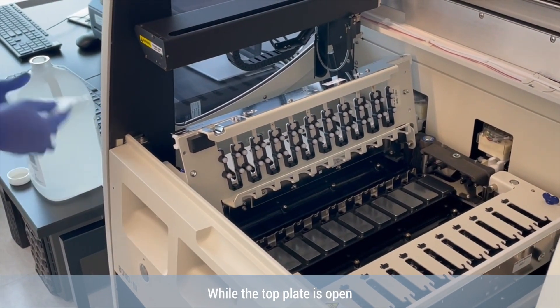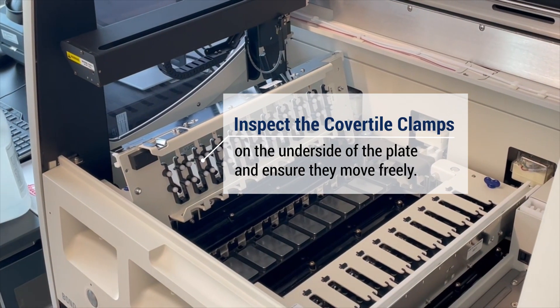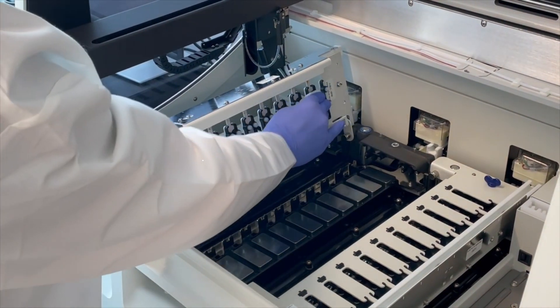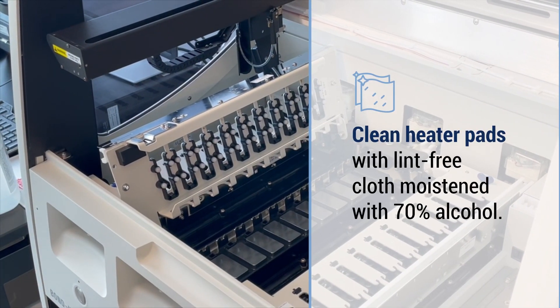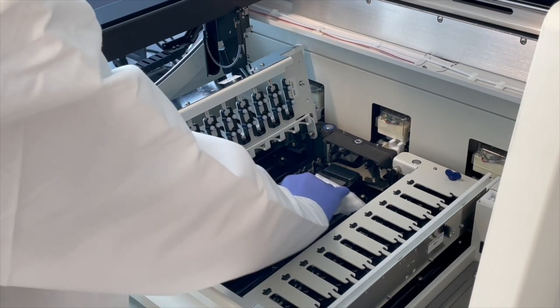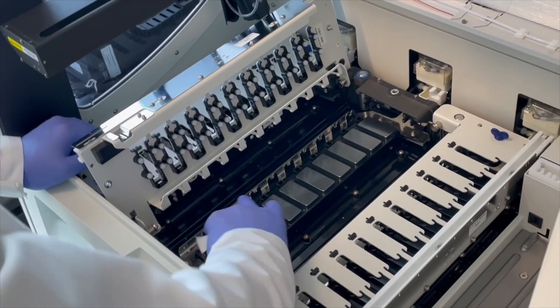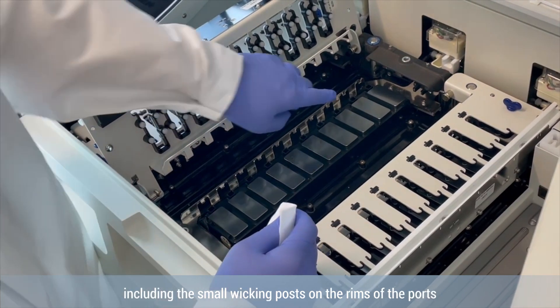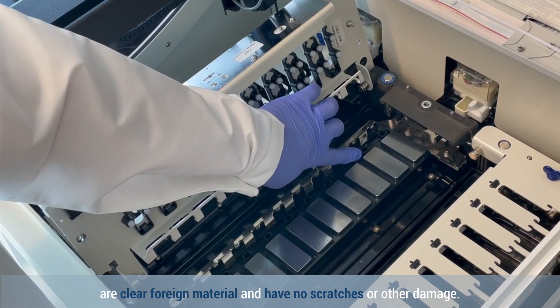While the top plate is open, inspect the cover tile clamps on the underside of the plate and ensure they move freely. Clean heater pads with a lint-free cloth moistened with 70% alcohol. Always check that the drainage ports, including the small wicking posts on the rims of the ports, are clear of foreign material and have no scratches or other damage.